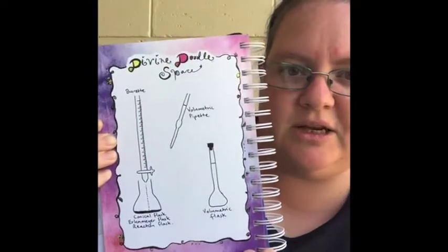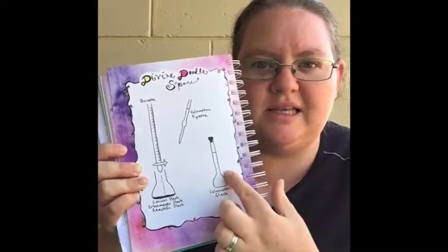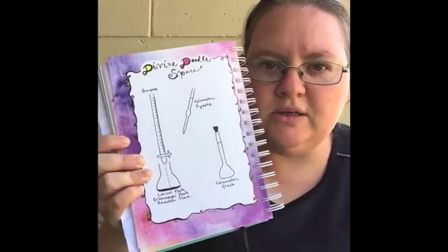I'm going to start with the potential for errors when we're making up our primary standard. If you do chemistry at school, your teacher usually has standards pre-prepared, so that's the part of the process you don't often see. Consider the fact that if you were doing this yourself, you would make up the standard solution yourself. The sources of error there are pretty standard: errors in weighing out your solid, not making your solution up to the mark very well, or if your volumetric flask is old it could not measure exactly what it says.